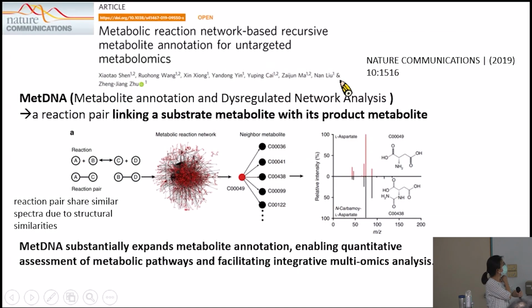Okay, so that is another platform that has been published in Nature Communications in 2019. This platform uses network-based annotations, and that is focused on the metabolic reaction. So let's look into how it works. We call this platform metDNA, the metabolite annotating and dysregulated network analysis.